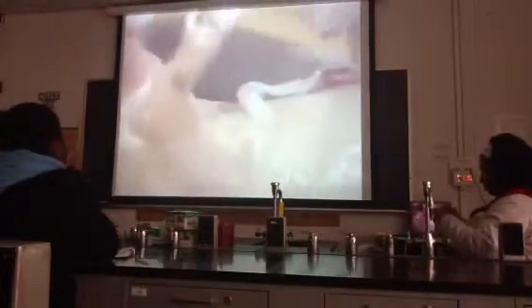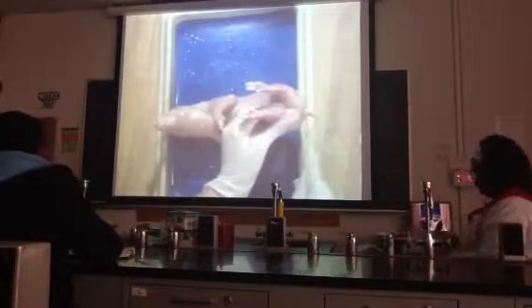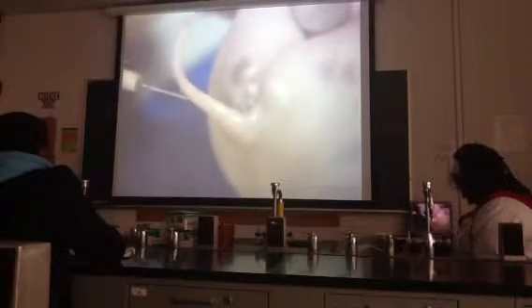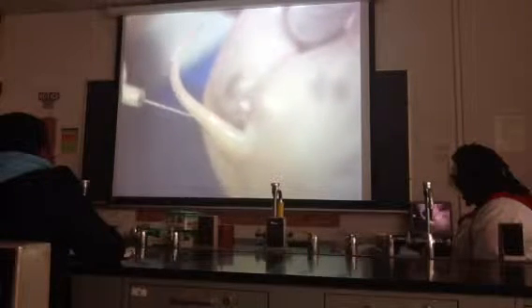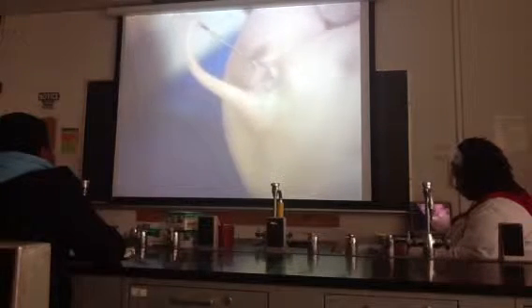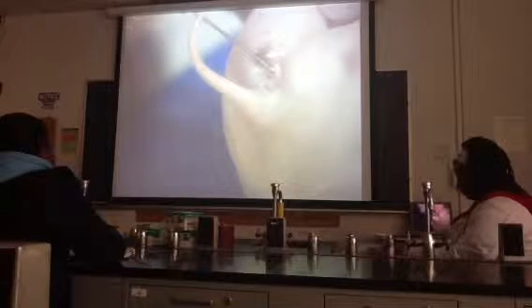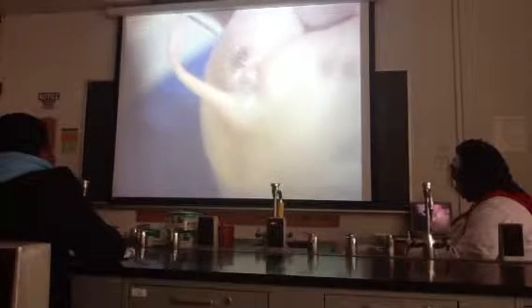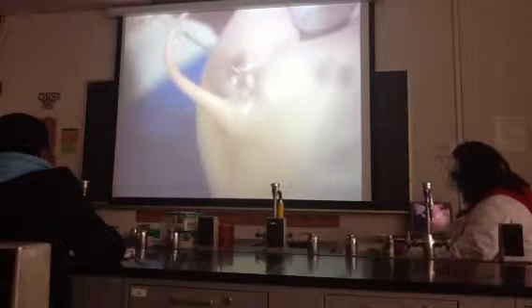At the posterior end of the organism, immediately under the tail, we see an opening, which is the anus that removes solid waste. In sexing your fetal pig, check for the presence of a urogenital opening immediately below the anus. If there's one present, that tells you that you have a female. Also in this area is a urogenital tubercle.